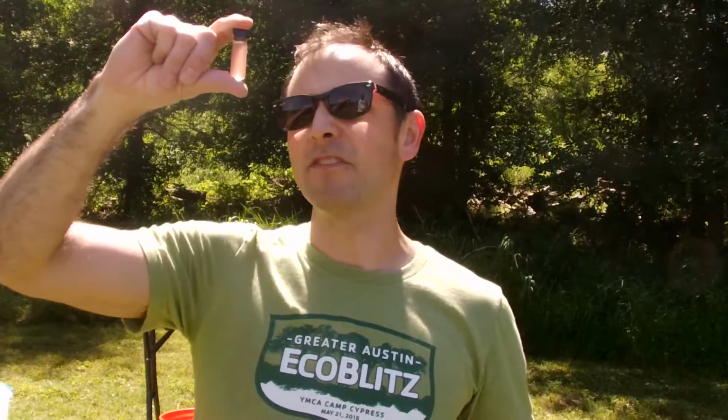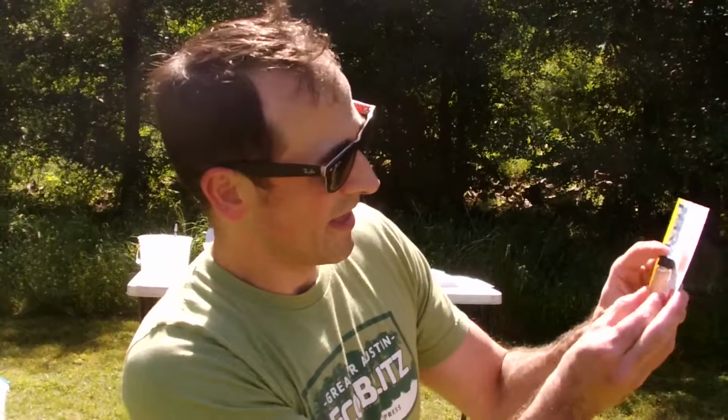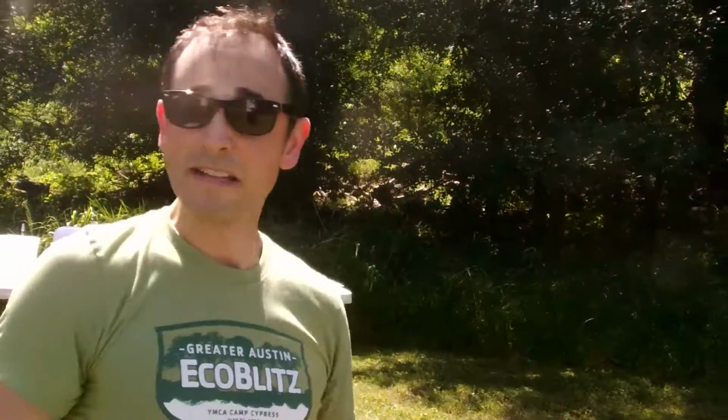So you're gonna take your tablets here, and the key here is to avoid putting it in direct sun, all right? Kids will want to do that, right? They want to go where there's sunlight, but not direct sunlight funneling through. So really what the instructions say is to take your thing and put it up against that right there, okay? So that is a 4, right? So 4 parts per million. Is that good or is that bad? That's good, right? We said those higher levels of dissolved oxygen support a lot of variety in your aquatic environment.